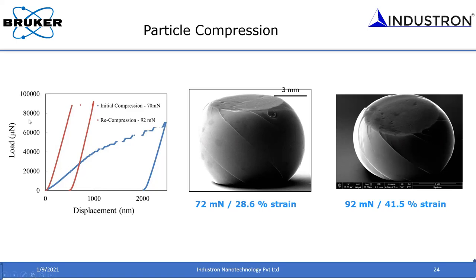Okay, now what you have is this load displacement curve, and you know what load it takes to fracture or deform. And from that load, you can calculate what the stress is. And you also know what the displacement is at fracture or when it undergoes some kind of plastic deformation. So from that information, you can also calculate the strain. So from the stress and the strain, for example, let's say you have a particle of say 100 microns and in a ball mill you want to reduce the size to 50 microns, okay? What force, what energy do you need to reach that 50% strain? That you can directly get from this load displacement curve, okay? You know what stress you have to apply, you know what strain it takes to reduce to that size. But if you take the area under the curve, you also know what the work done is, basically how much work needs to be done to get to that size.